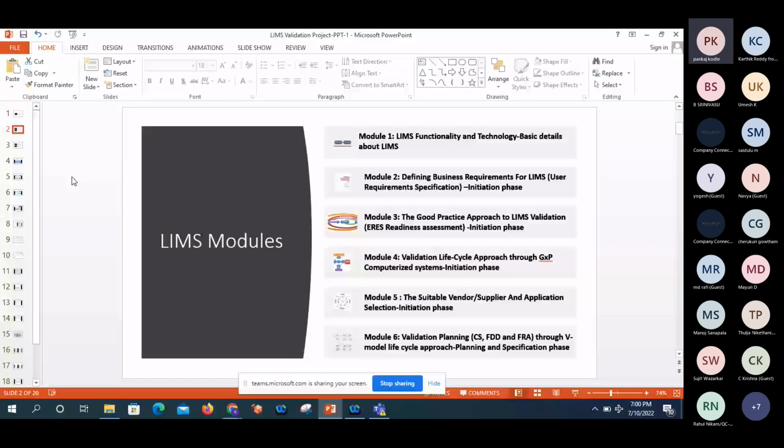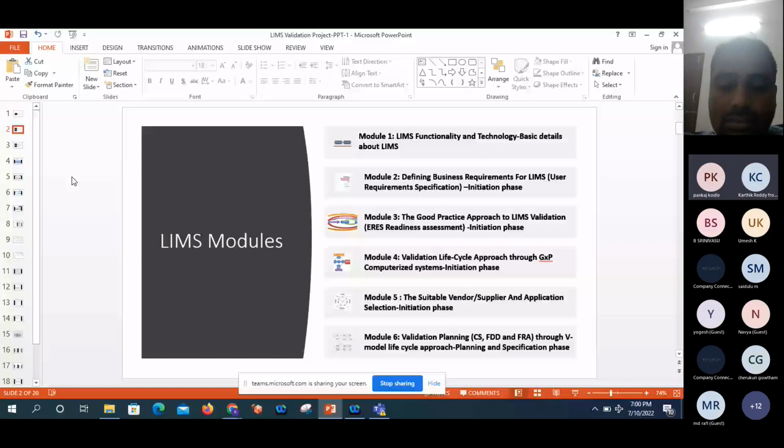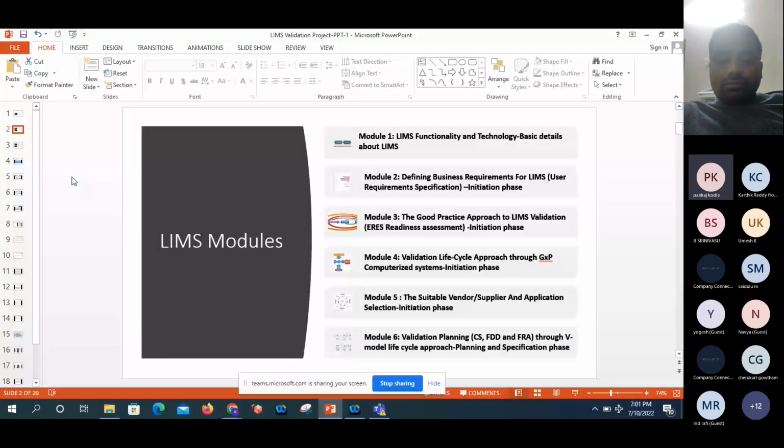My question is that we will test the complete stability module. The first module, the lot module, is implemented, and the second module is the implemented inventory module. Apart from inventory module testing, is another testing required? For the second module, we can check the complete flow. But apart from that, which testing do we need to check in each and every module when we implement a new module?